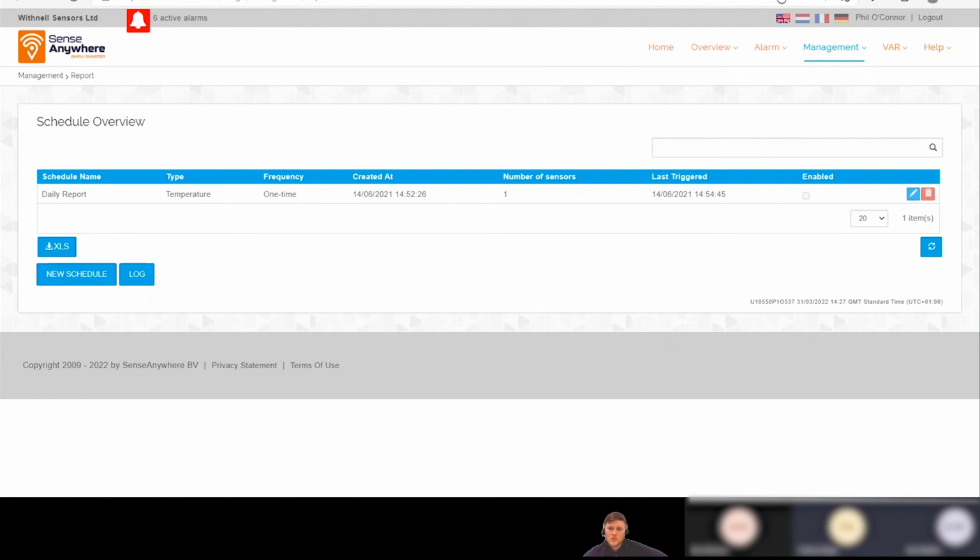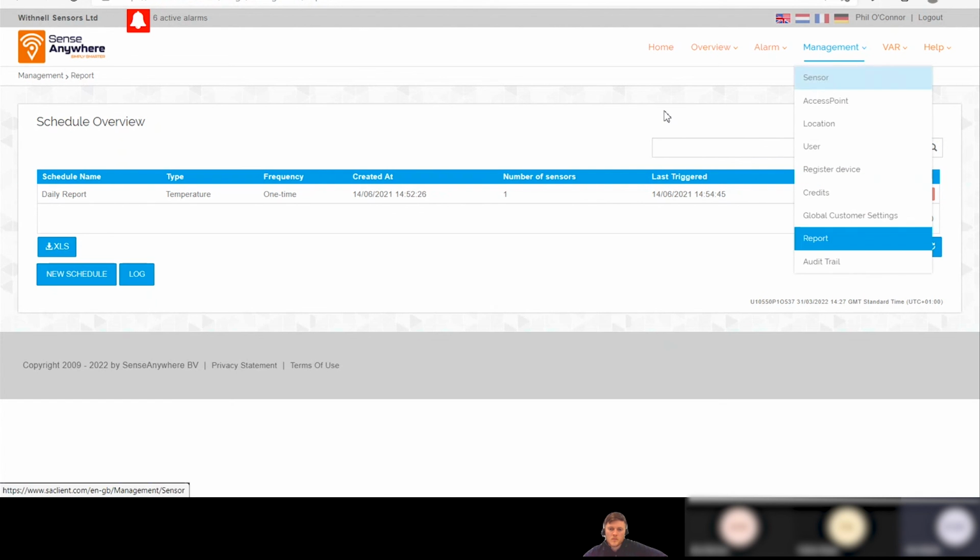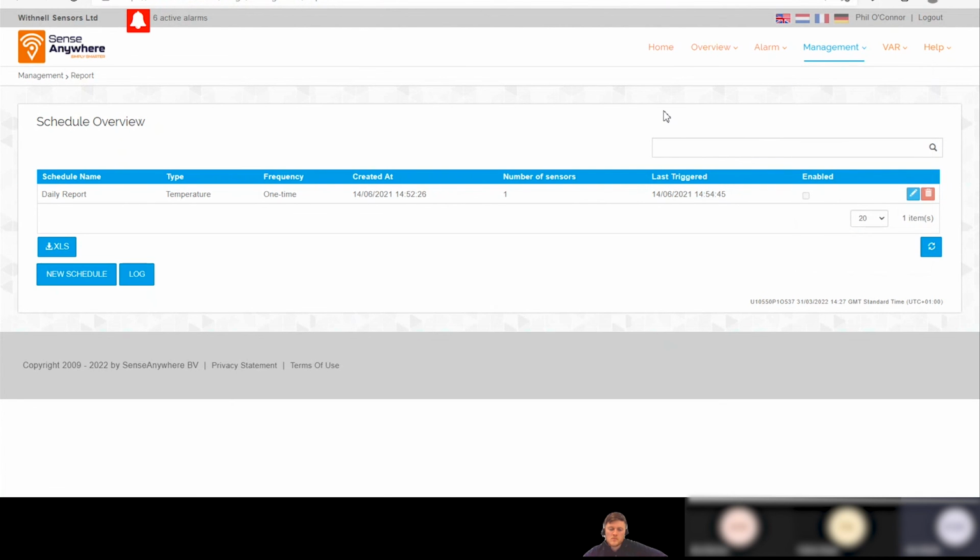In terms of the output, you're obviously able to export into CSV. Is that adaptable in any way? I suppose from our point of view, what we were hoping to use the system for is mapping our clients' chambers as part of a 17025 mapping. And is there any selectable or changeable parts of that CSV export, or is it just a flat out binary export, if you know what I mean, or is it interchangeable?